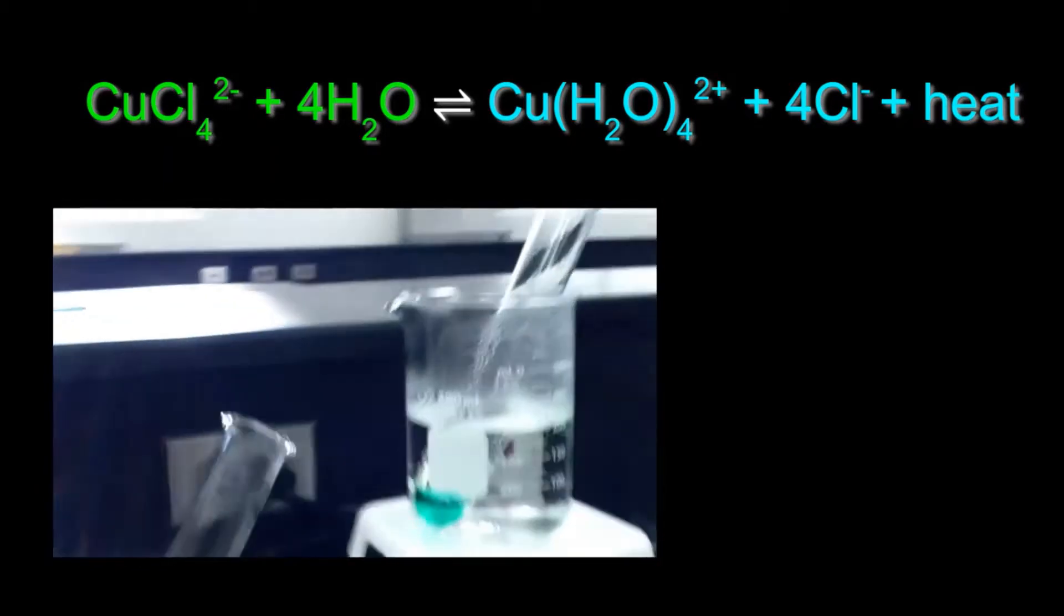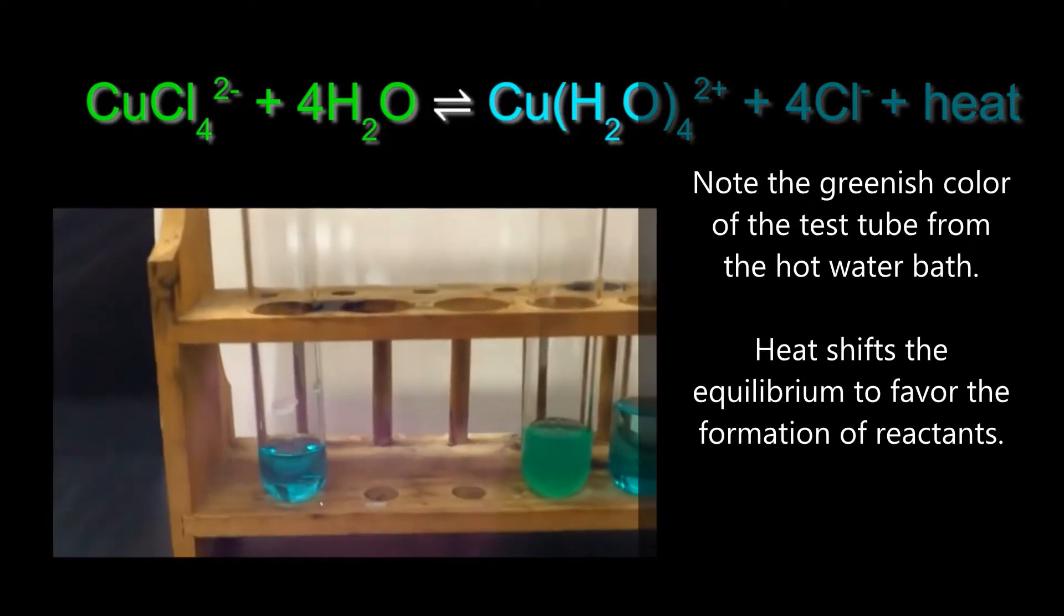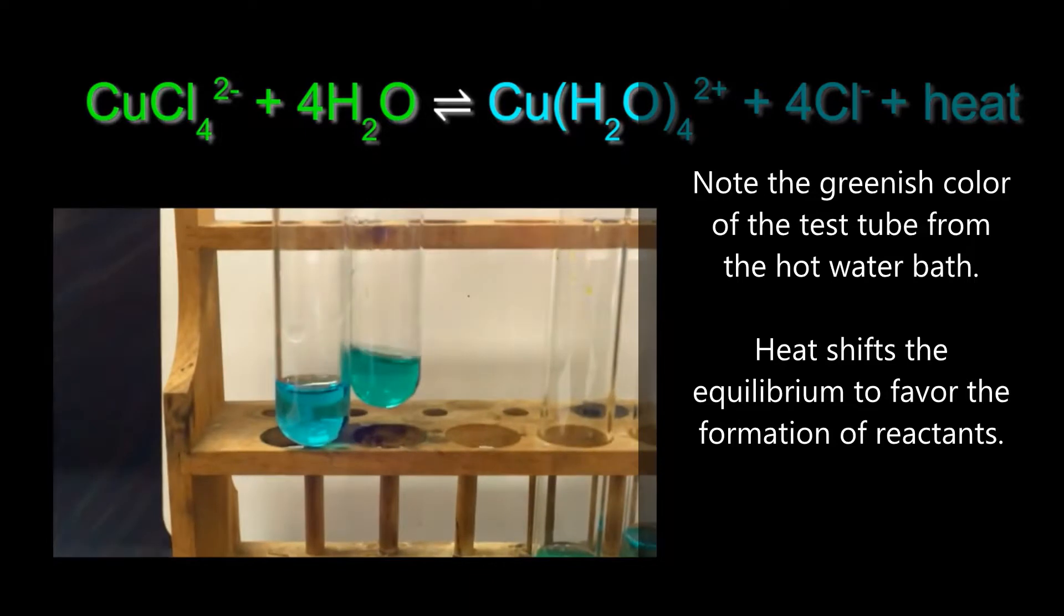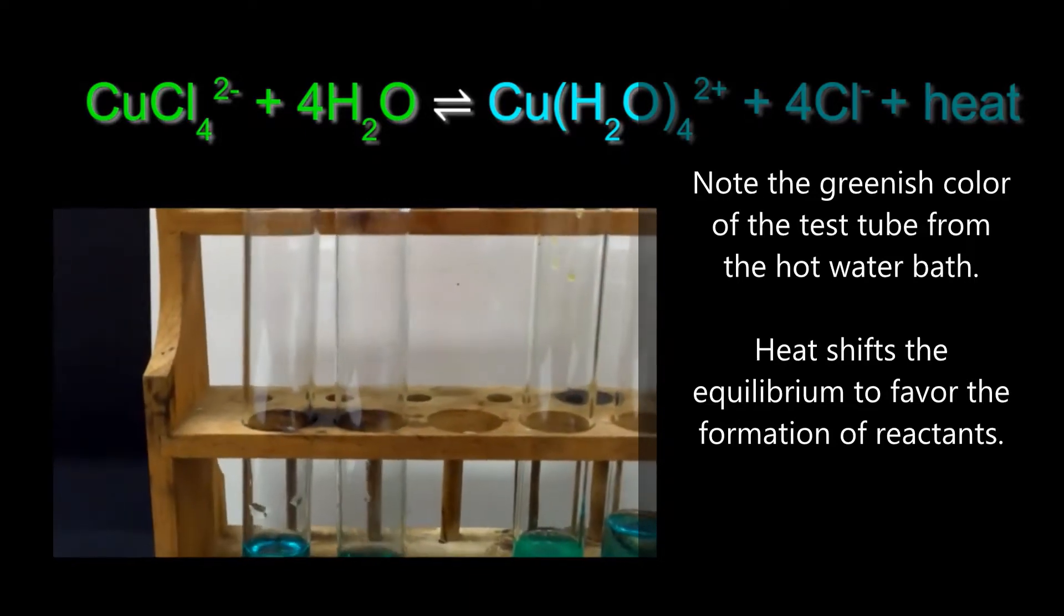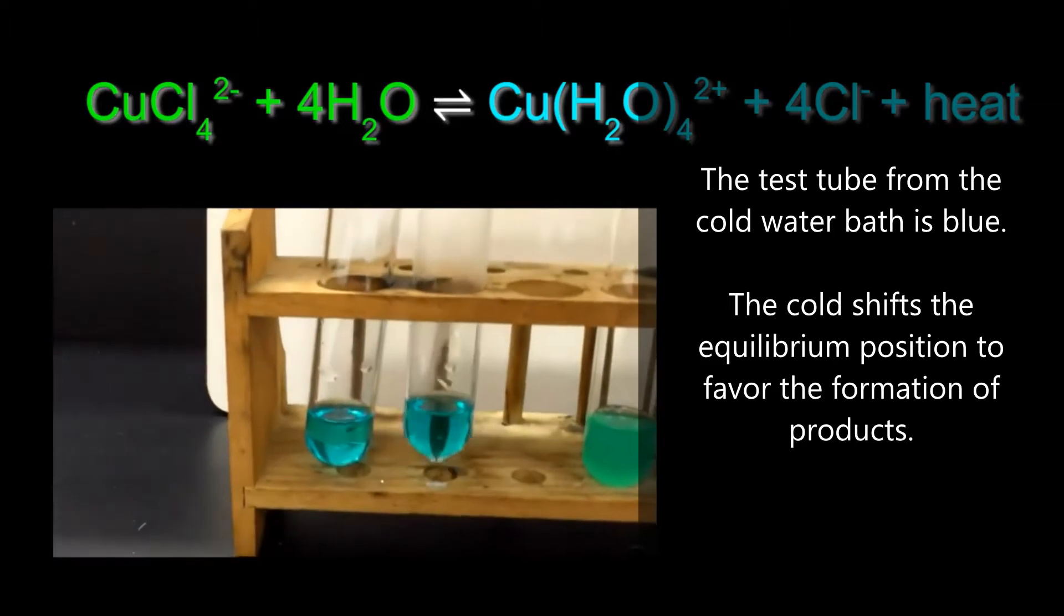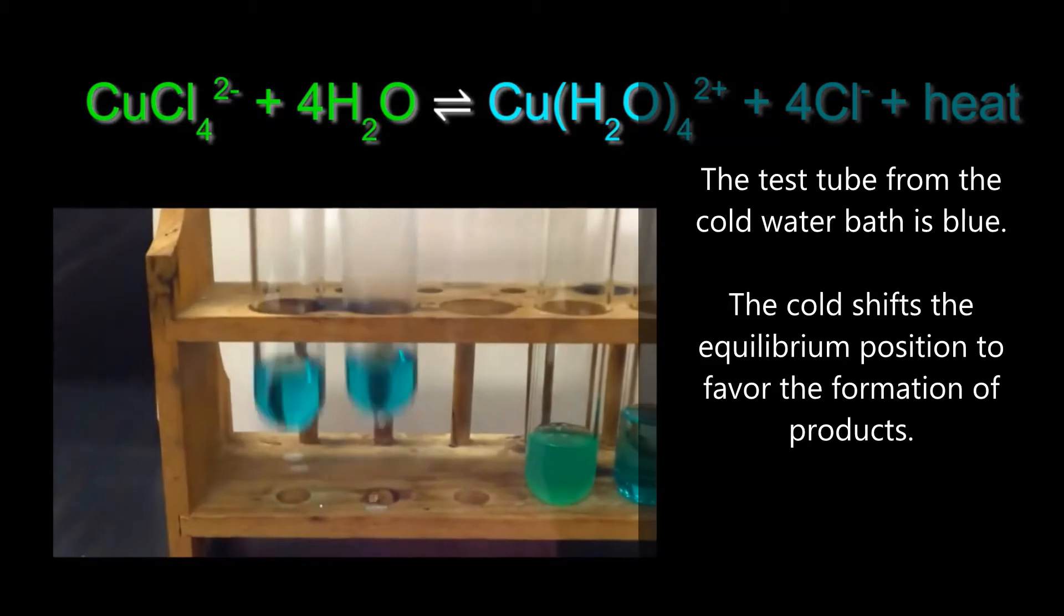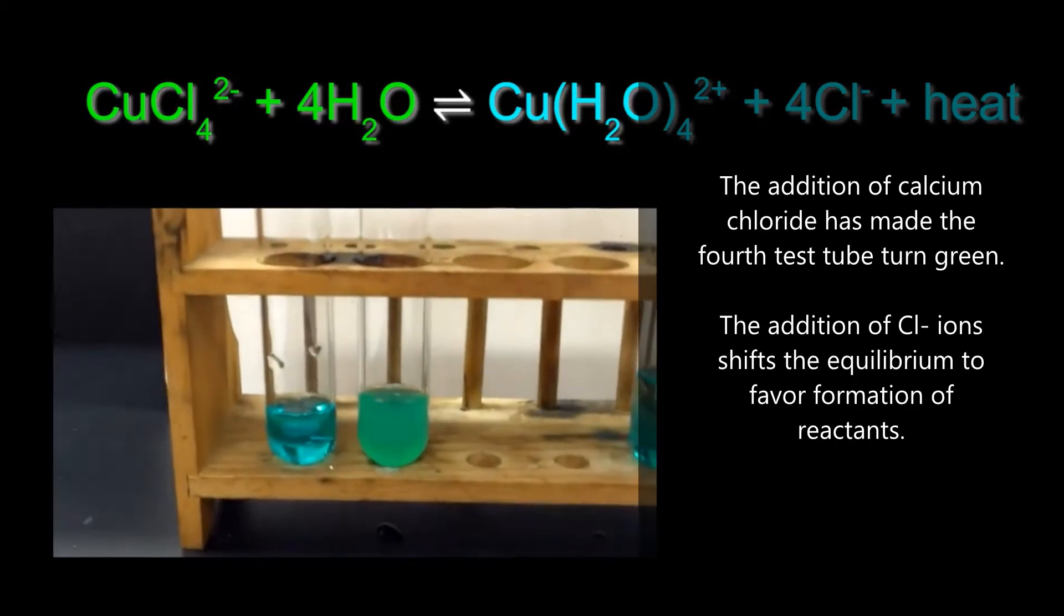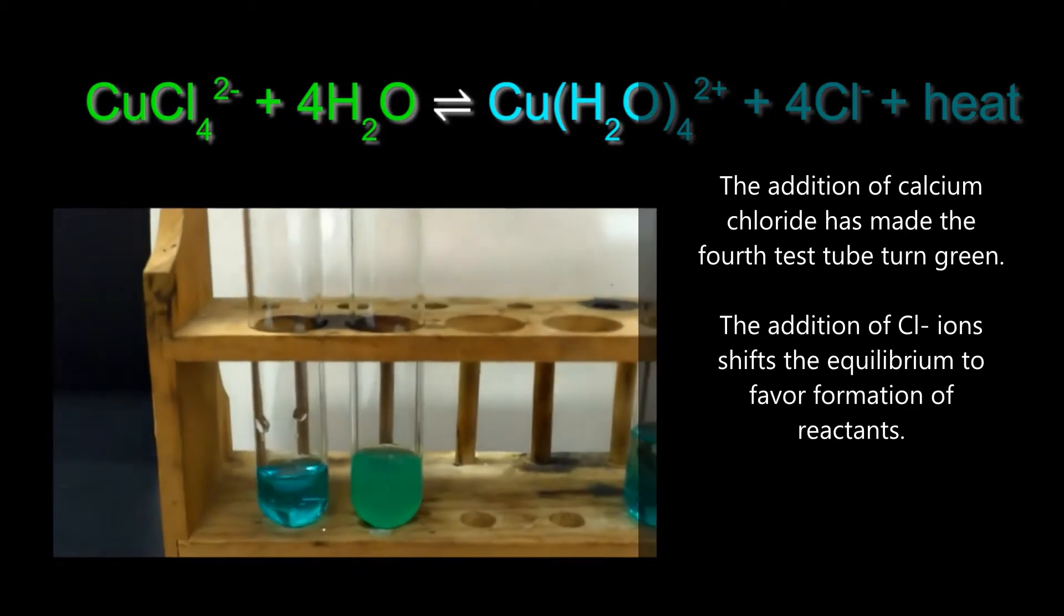Notice the color of the tubes. Note the greenish color of the test tube from the hot water bath. The heat has shifted the equilibrium position to the left. Notice the tube from the cold water bath is blue. The absence of heat shifts the equilibrium position to the right. Notice the addition of chloride ion from the calcium chloride has caused the test tube to turn green.